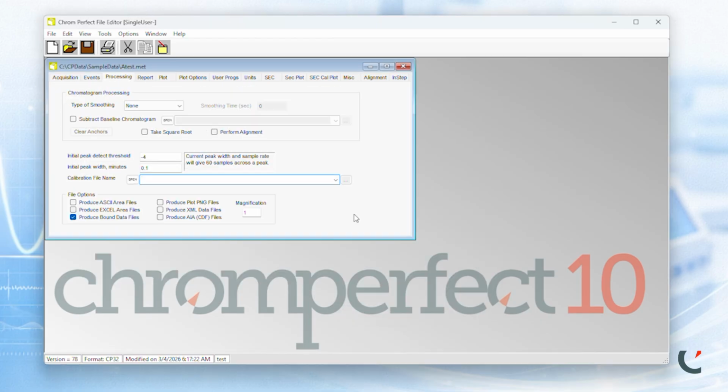Briefly open the Processing tab. If this were a calibration method, the calibration file would be referenced here. In this example, no calibration file is assigned. That is intentional. Calibration fundamentals will be covered in a later section. Another important setting to observe within the Processing tab is that by default, the option to create a bound or BND file is selected. If you remember Chapter 2 in this section, you should know the benefits BND offers over raw data files. For that reason, it is recommended that you never change this setting.